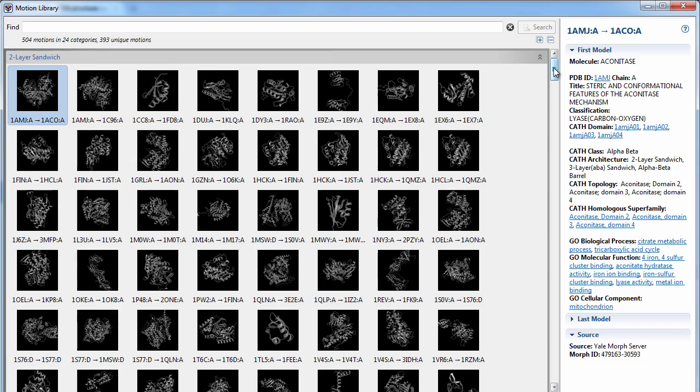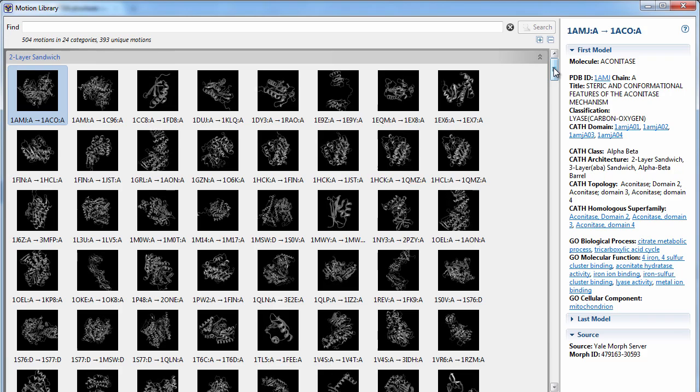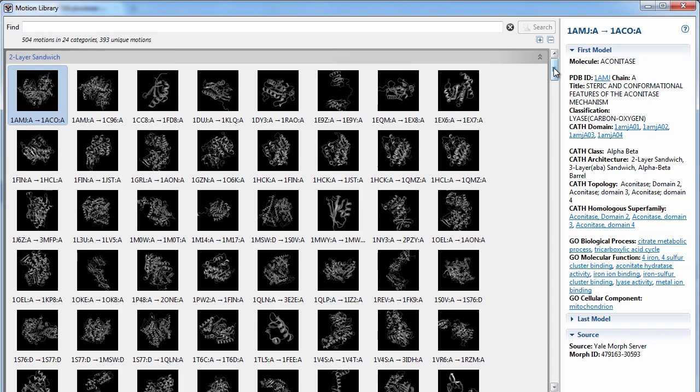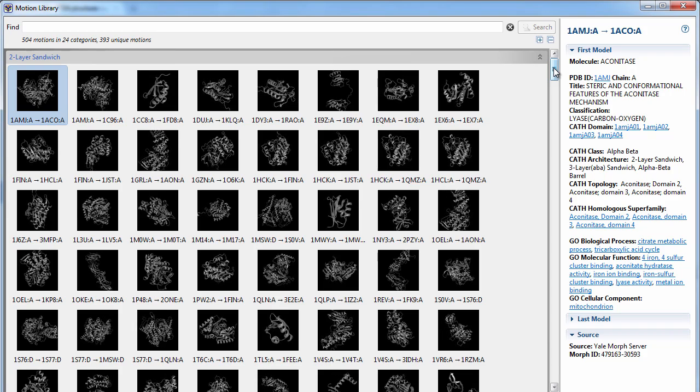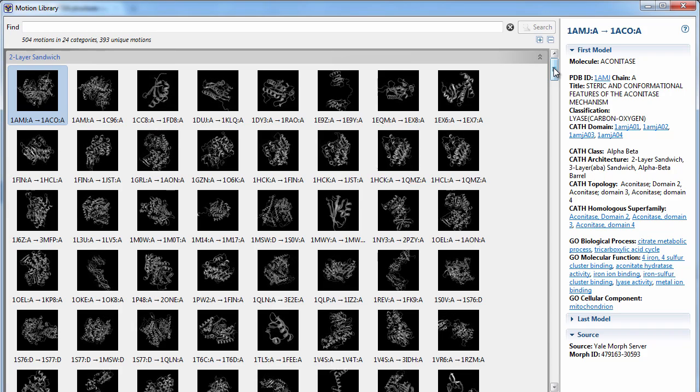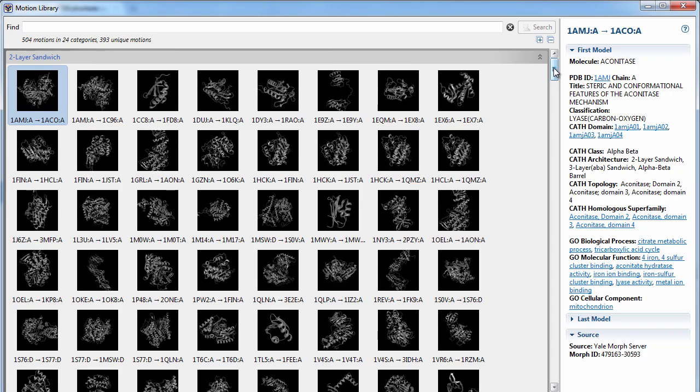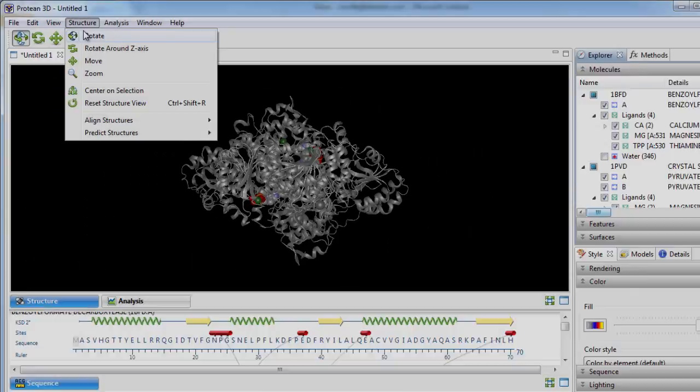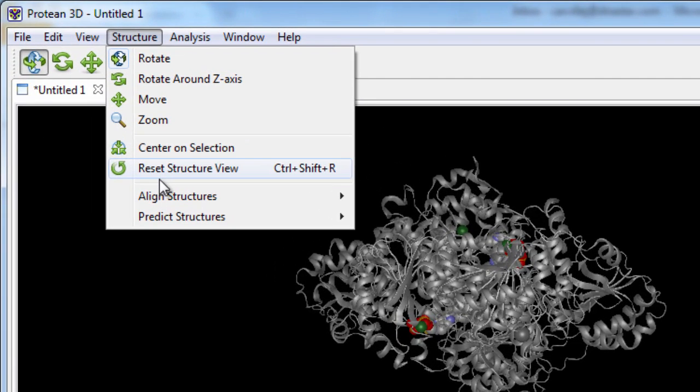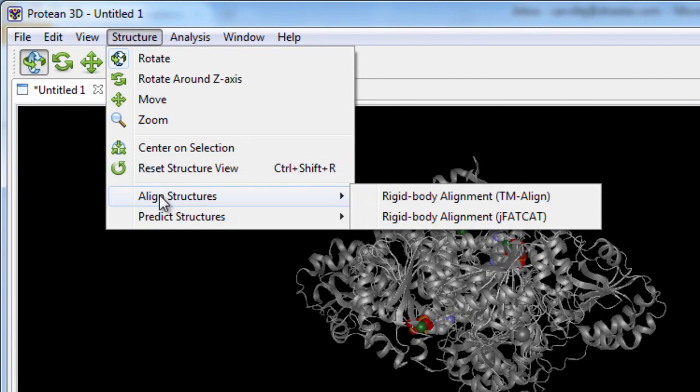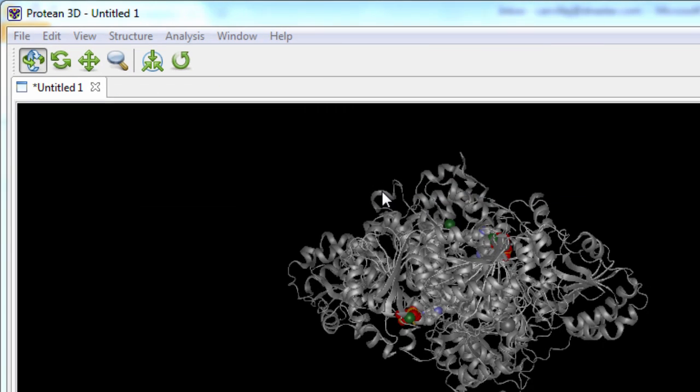With Protein3D, you can also view protein conformational changes using our motion library. Align multiple structures to identify regions of similarity between two or more protein structures.